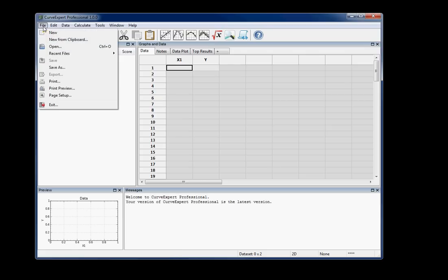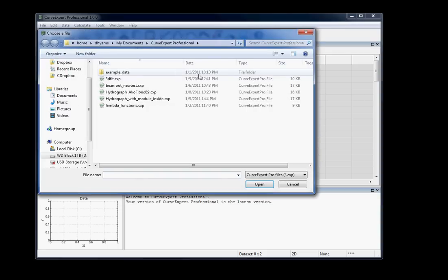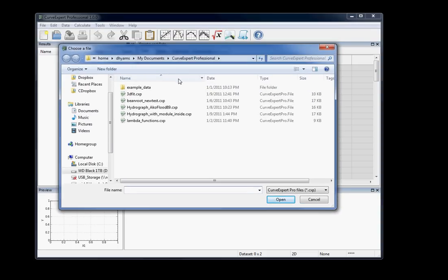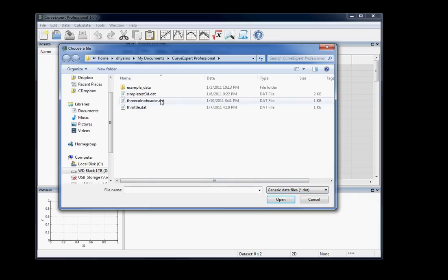Now to do so, you would need to go to File, Open, you can see the File Picker open here. Now CXP files are CurveExpert files, so at the point at which you're starting, aside from the example data, you probably won't have any of those yet. So you'll typically need to go and select generic data files or text files, whatever you happen to be wanting to read in.